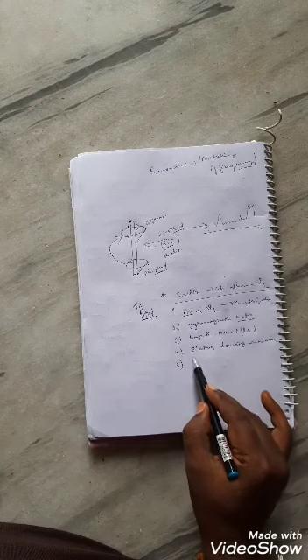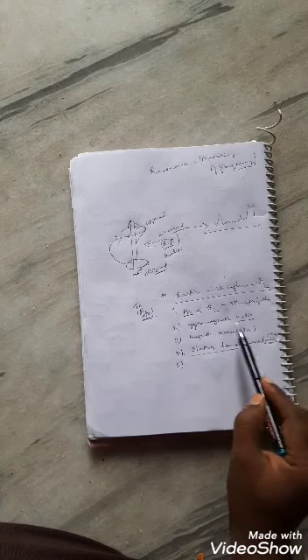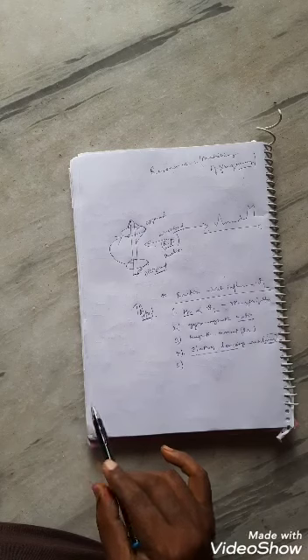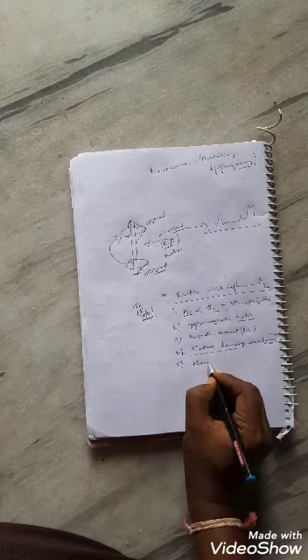So the magnetic field generated by these electrons nearer to the nucleus influences the magnetic nature of the nucleus, and this also influences the Larmor frequency of the nucleus. And then the nature of the nucleus.